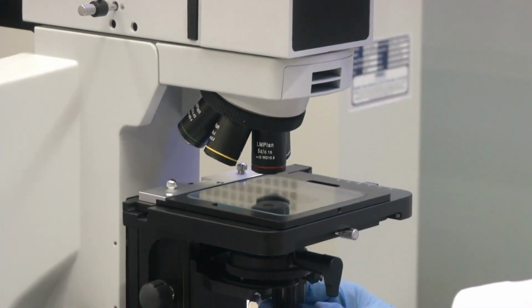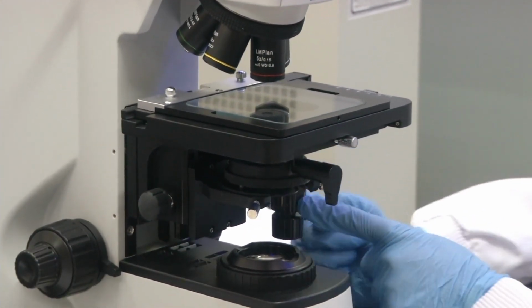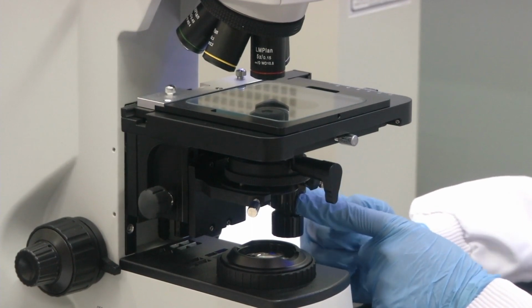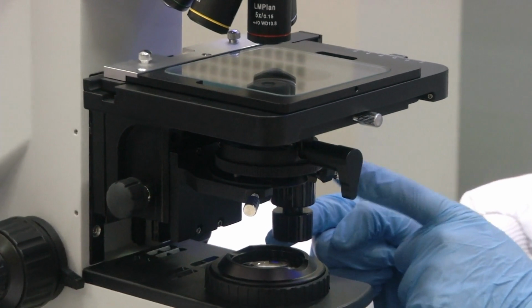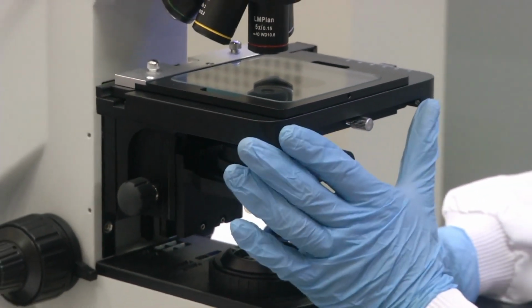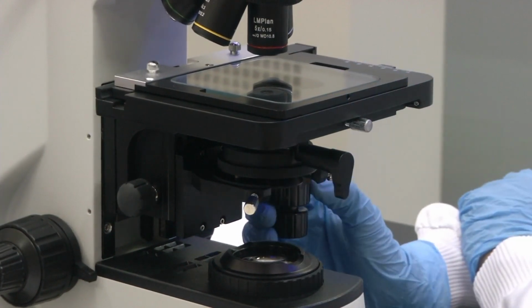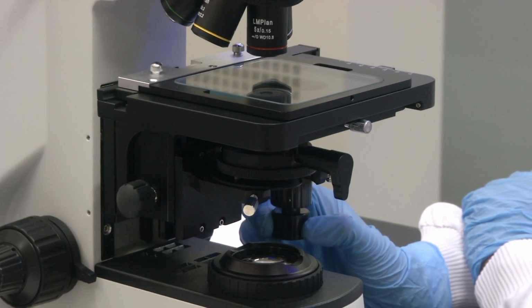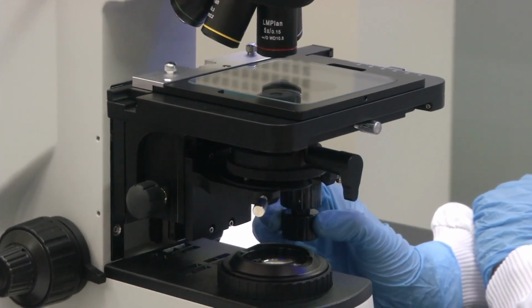So, just below the sample holder there is a knob where my blue gloves are. I think you can see it. This knob is used for XY movement of your stage. The sample holder in a metallurgical microscope is called a stage. If you adjust the knobs here, you can move the stage. I think you will be able to see the stage moving.